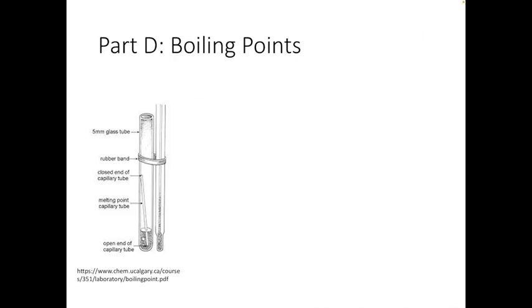All right, so now we're going to skip part C, which is a flammability test, just for safety reasons. But we are going to perform part D. So we're going to determine the boiling points of our different compounds. And we do know which boiling points to expect for the known compounds, but we can correct our thermometer if it is slightly off, so we can calibrate it. Additionally, we can then test our unknown compound and see if it matches any of our known compound boiling points.